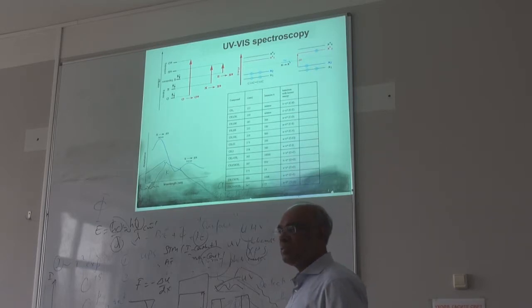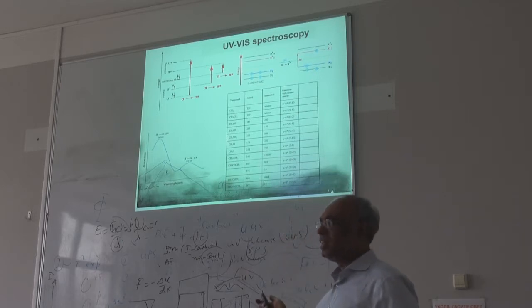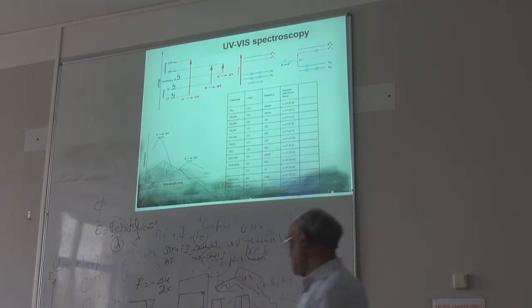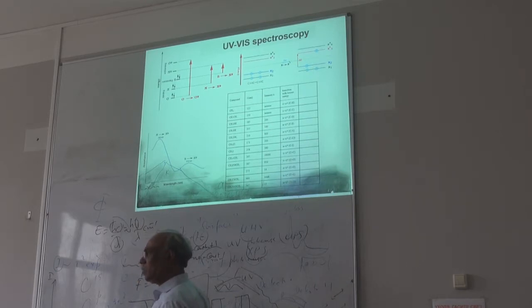This is the most fundamental spectrometer. You have your sample, then you have your light coming in, and your detector here, so you get the transmitted light. Or if your sample is not transparent, then you have to use the reflective one, right?